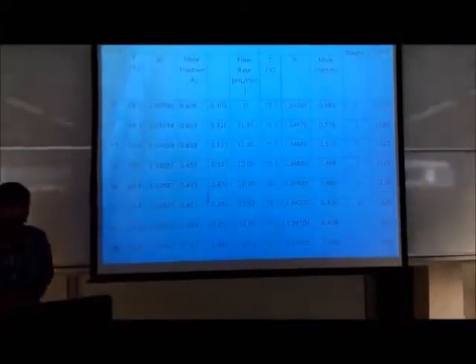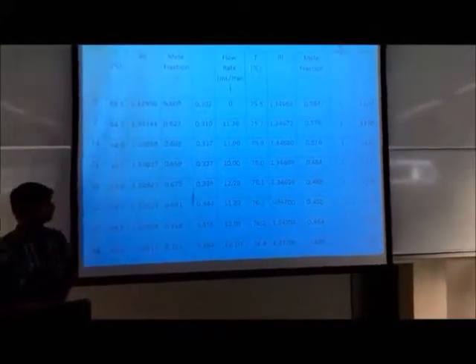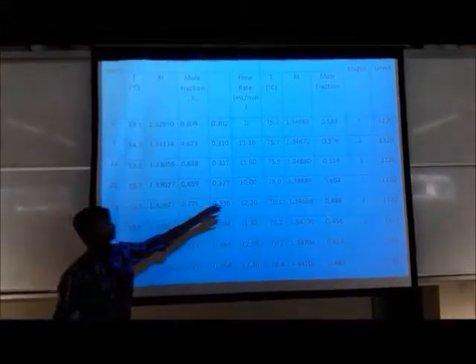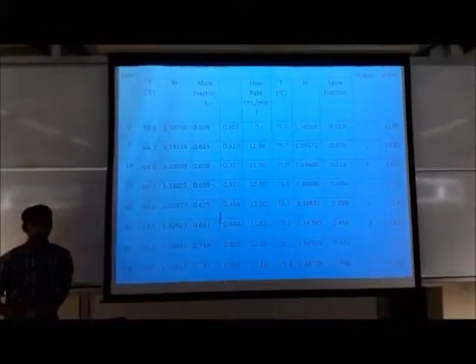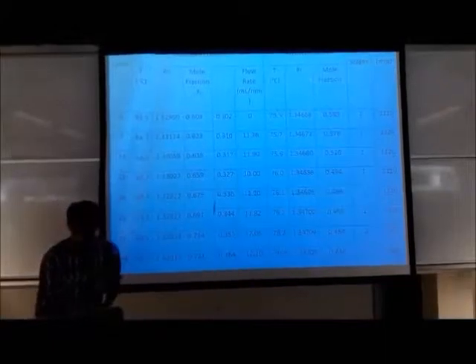This table shows us the data that we obtained from our experimental result. As you can see, there are two types of product, which are the distillate product and also the bottom product. Each reading that we take consists of 7 minutes. So we have taken 8 readings, which consist of a total of 49 minutes.